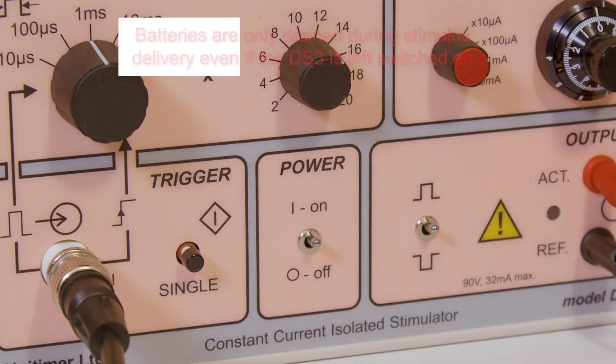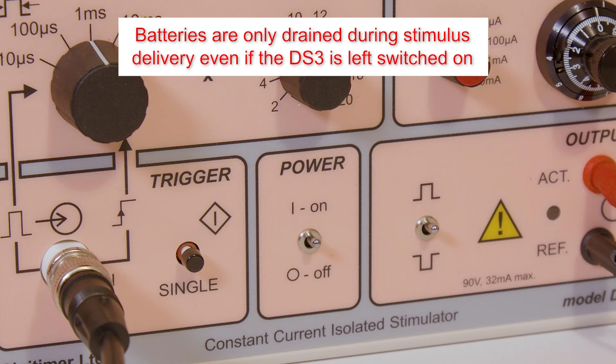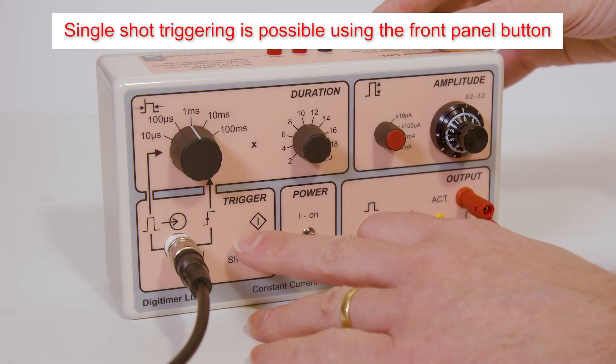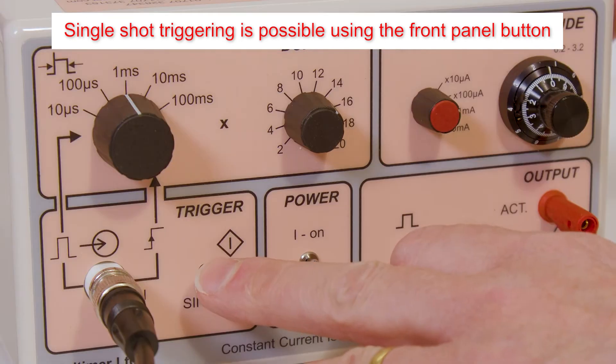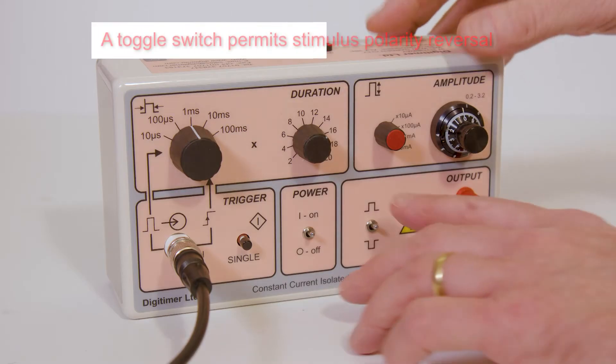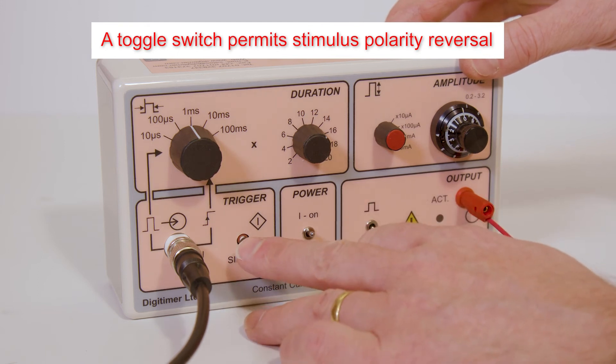Power is provided by 10 9V PP3 alkaline batteries, plus a single battery for control circuitry. Batteries are only drained during stimulus delivery, even if the power switch is left on by accident. A single shot trigger button permits internal triggering of the stimulator, and stimulus delivery is confirmed by the amber LED located near the output sockets. The polarity of the stimulus can be reversed using the front panel toggle switch.